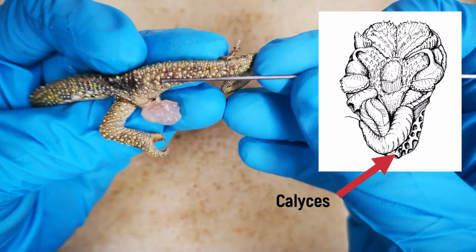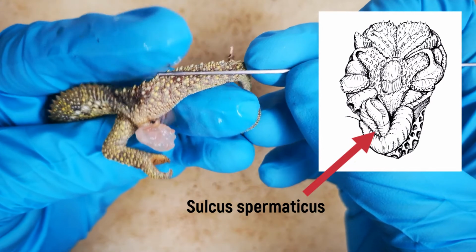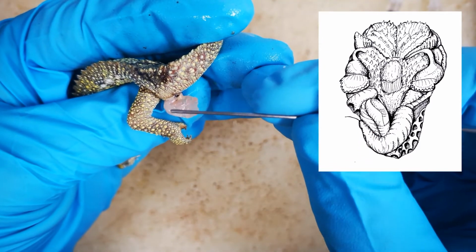Rotating, we can now make out the sulcal surface. The sulcus spermaticus is a groove that transports sperm into the female's reproductive tract, and it is this structure that we use to define the sulcal and asulcal surfaces of the hemipenis.